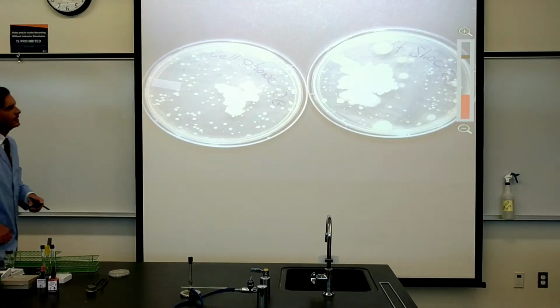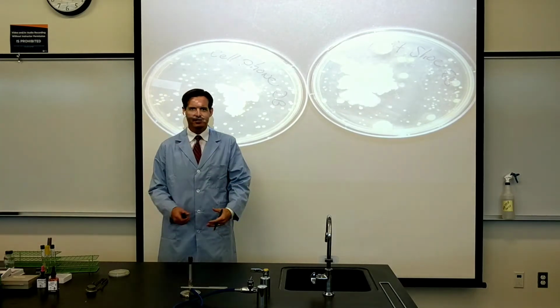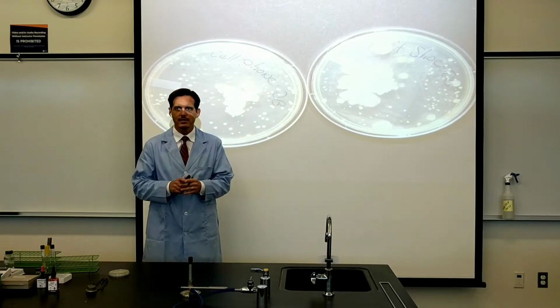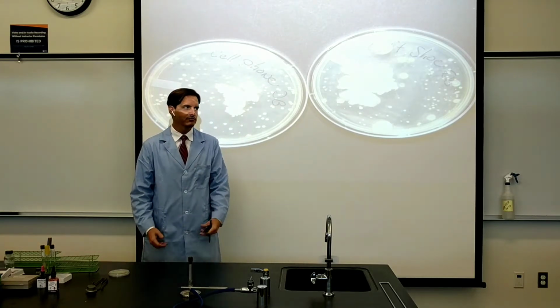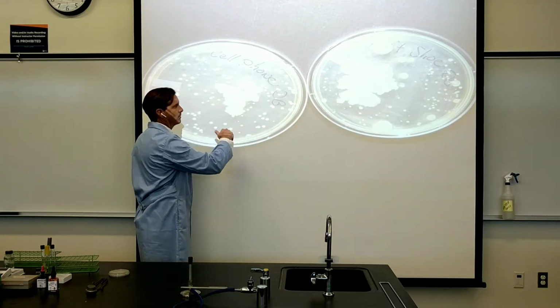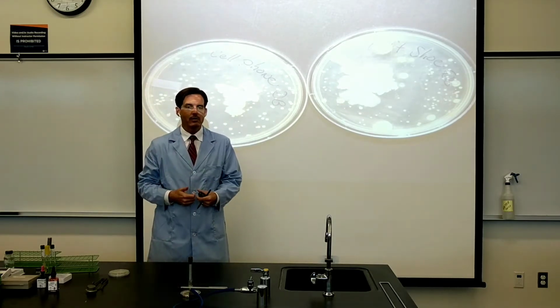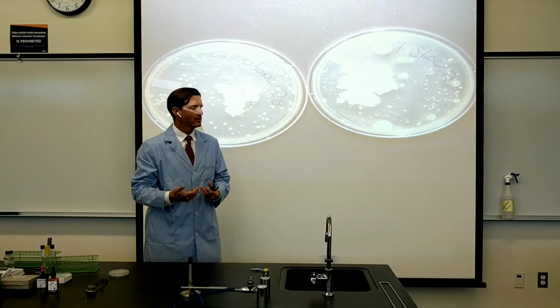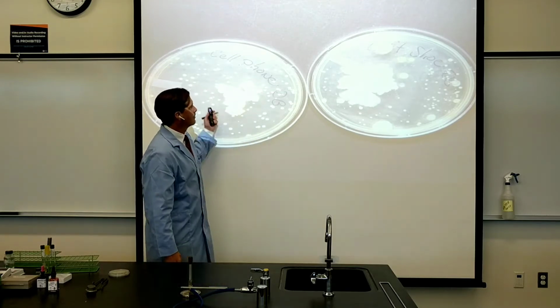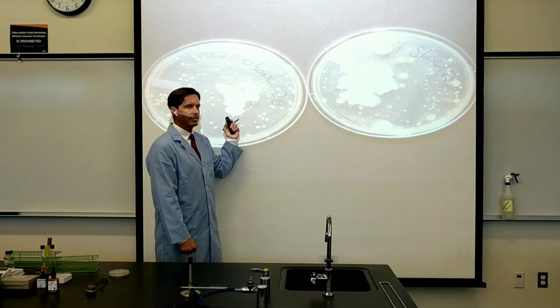My cell phone has a surprising number of bacteria, no question. That's not exactly like a good thing in my mind. I mean, yes, I know that we have bacteria all over us. You need to be aware, you're wearing a suit of normal flora bacteria all over your skin. But your cell phone, or whatever it is that you commonly touch, door handles, keyboards, you name it, we call those objects fomites. And I'll spell that out for you, F-O-M-I-T-E, in our lecture. And what you'll see is that when you sample fomites that are common use items, they look just like a skin sample.